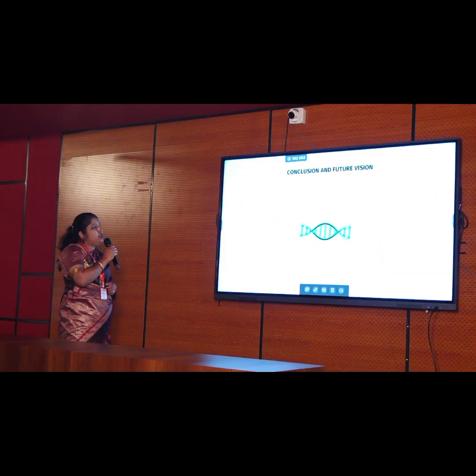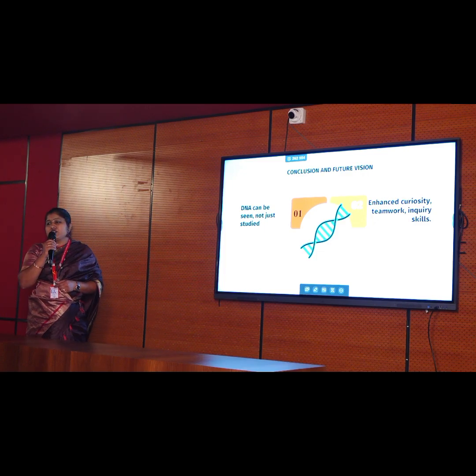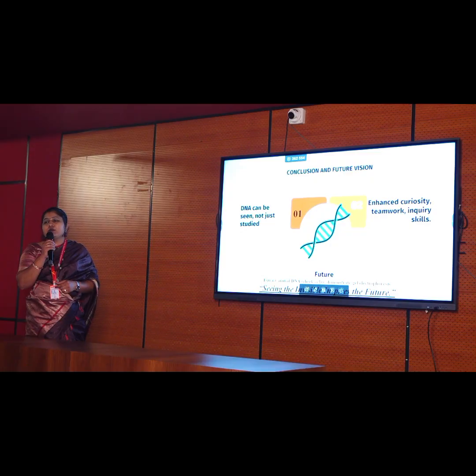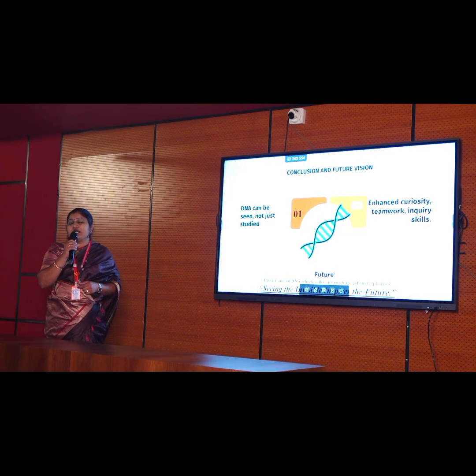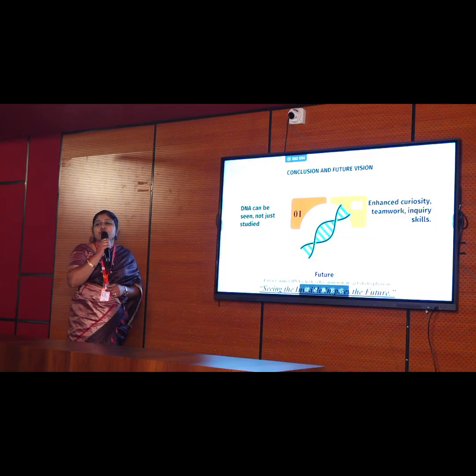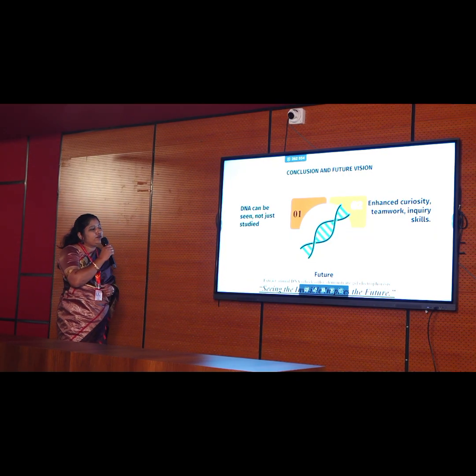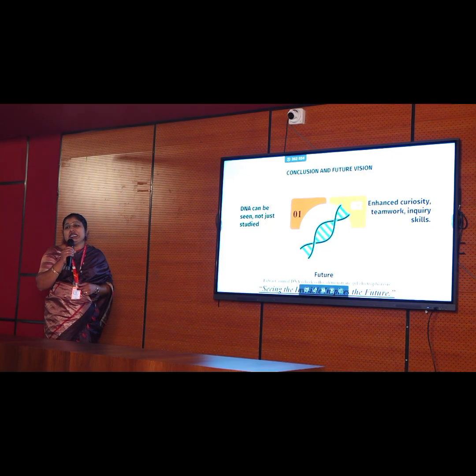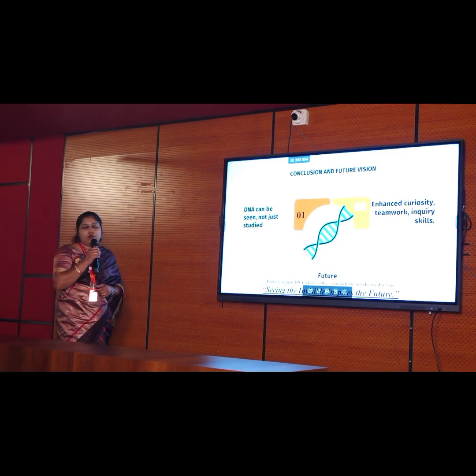Finally, to conclude, what we can see is that DNA can actually be seen, not just studied. It enhances curiosity, teamwork, and inquiry-based skills among the students. In the future, we can even show them plant cells, and apart from plant cells, animal cells also, and we can demonstrate the gel electrophoresis technique. A simple quote I would end with: seeing the invisible actually inspires the future. This is the quote from my end. Whatever invisible things we can see will inspire future generations.